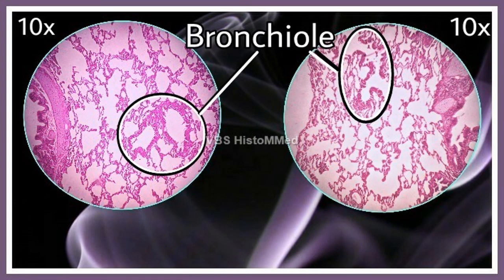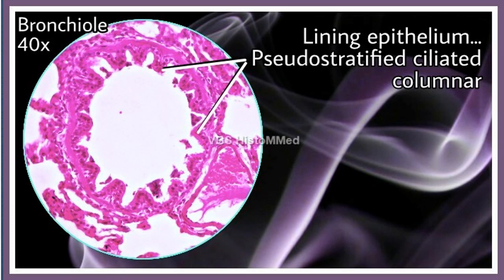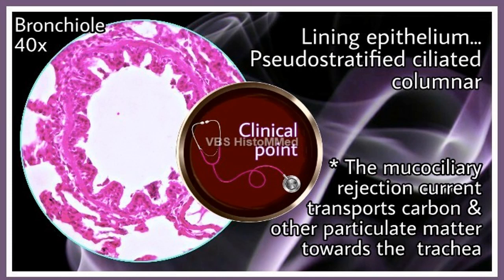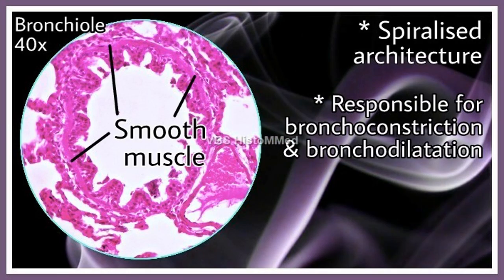There are two photographs here — one is a cross section of the bronchiole, the other a longitudinal section. The lining epithelium of the mucosa continues to be the typical respiratory epithelium: pseudostratified ciliated columnar epithelium — the same as in the bronchus. Because it is ciliated columnar, the mucociliary rejection current transports particulate material like carbon particles upward toward the trachea, helping in the cough process where sputum is expelled.